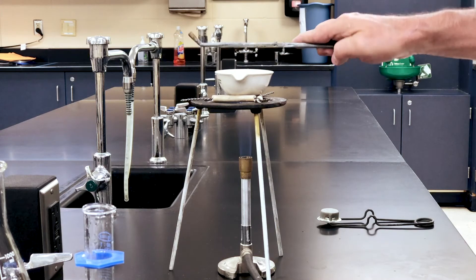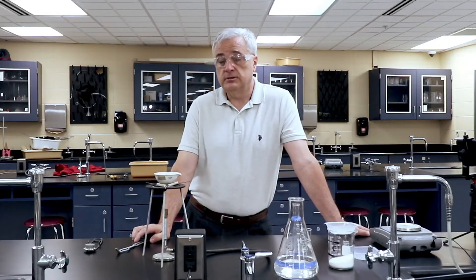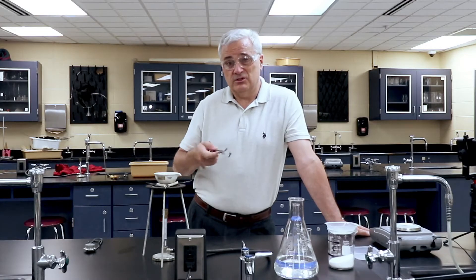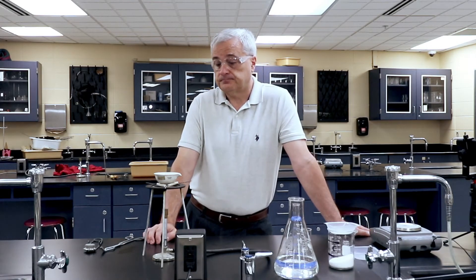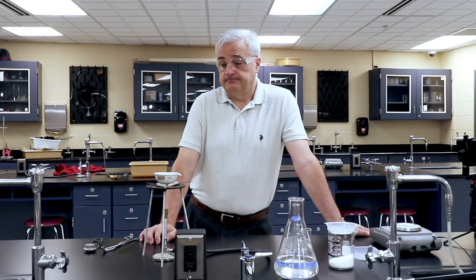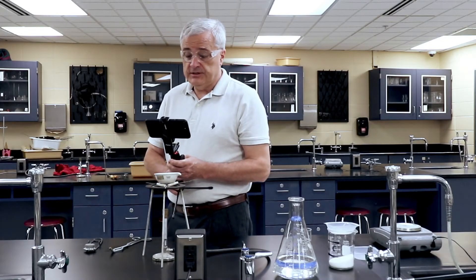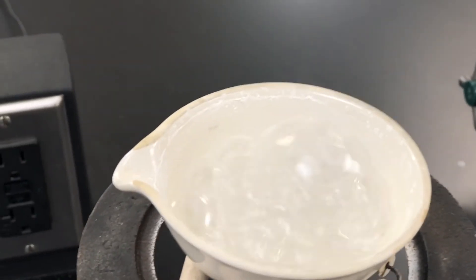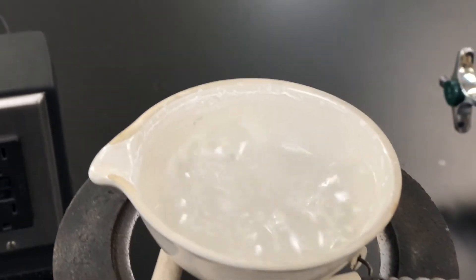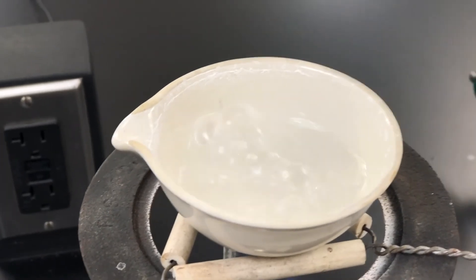I'm adjusting my evaporating dish, which I did not get very level on the Bunsen burner to start with. This is very hot now — you would not want to touch this with any part of your body. You can begin to see that there's a residue forming on the side of the evaporating dish — it looks like a sort of whitish powdery residue.